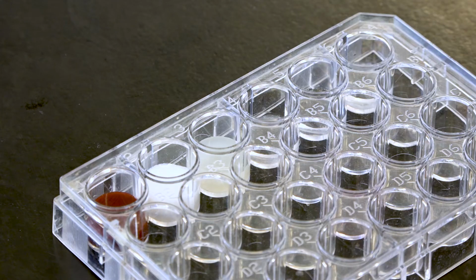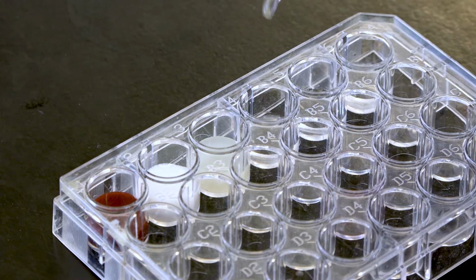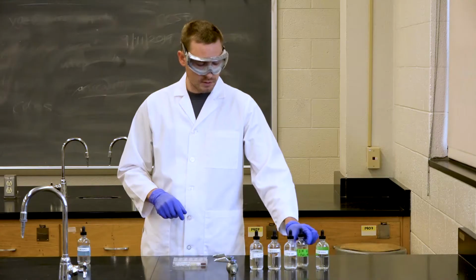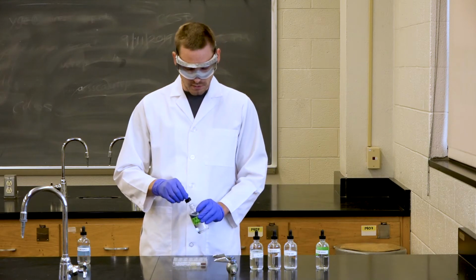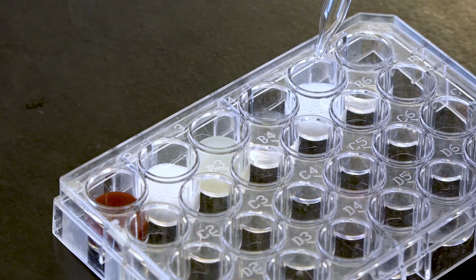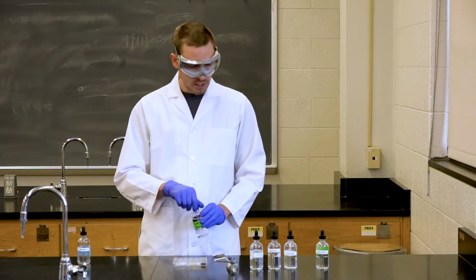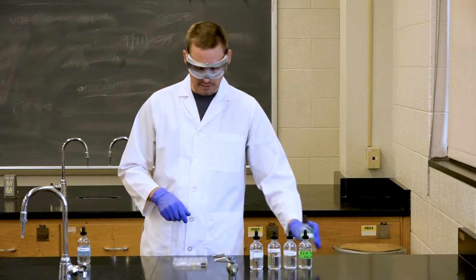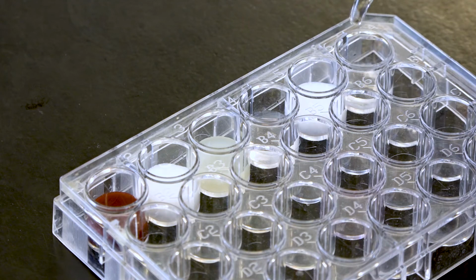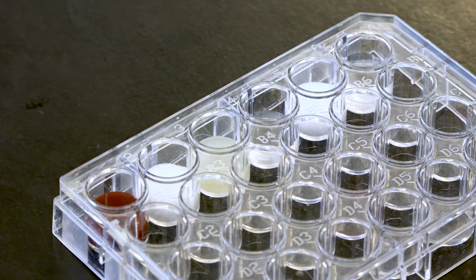Next, we will add DMG to the fourth well. As we observe it, we see that no reaction is taking place. Next will be hydrochloric acid, which creates another white precipitate. And finally, we will add sulfuric acid to the final well. And again, we see that no reaction has happened and no precipitate has formed.